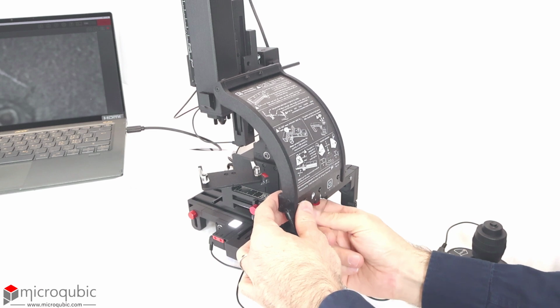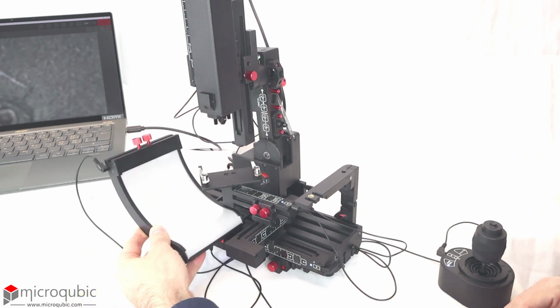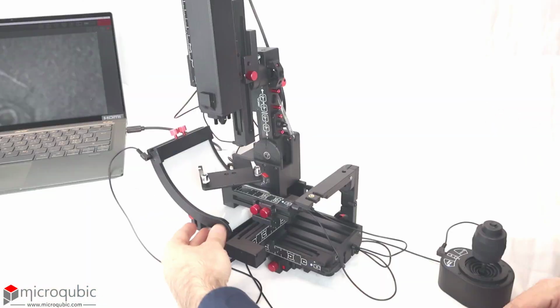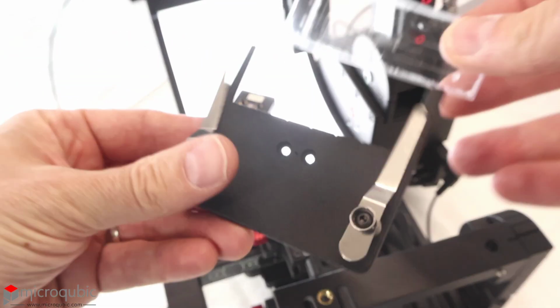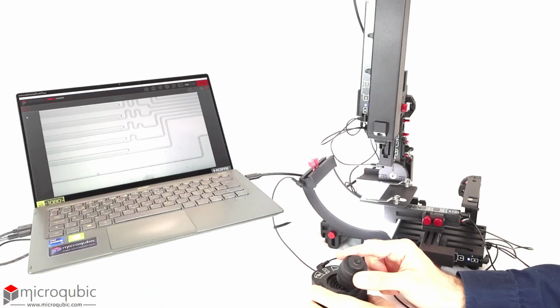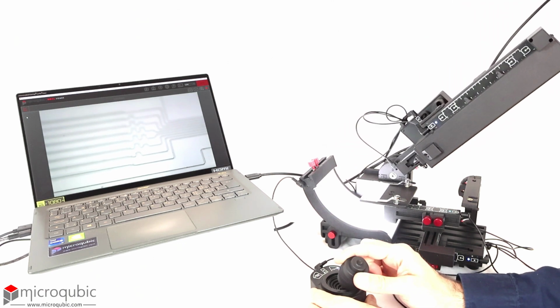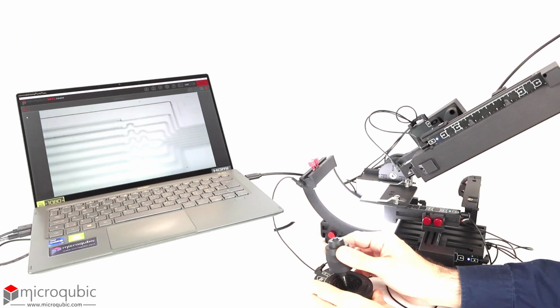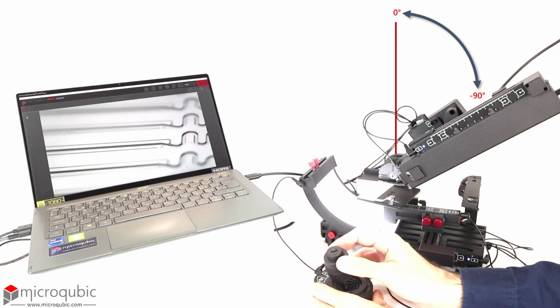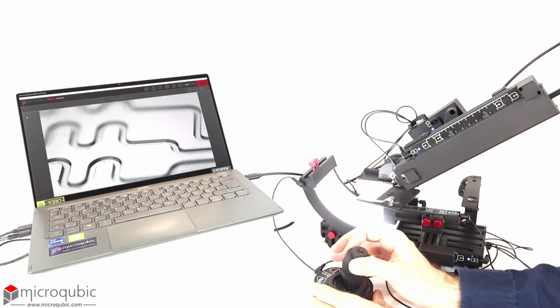Let's now move to the transmitted light microscopy mode, which can be used to image transparent samples like microfluidic chips. In this mode, the curved illumination is placed underneath the sample, as shown in the video. Then you can use one of the provided sample chucks to fix your sample. Smaller samples can be placed on a glass slide or fixed using custom-designed holders. For 3D imaging, the camera is tilted to negative viewing angles. The high zoom lens and the ring illumination can also be used in this mode.